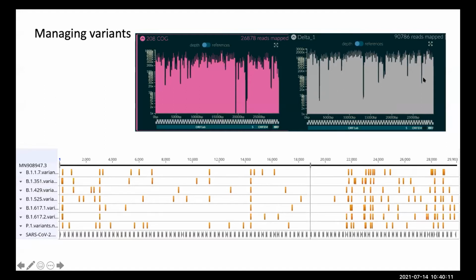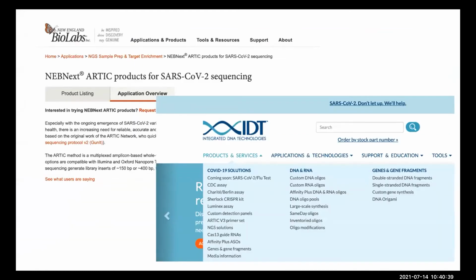We've actually fixed these lower regions now as well, which were caused by interactions where there were mismatches, which meant they weren't being detected. That's what some people call primer erosion, but it's basically where your primers become inefficient or non-functional due to mutations or deletions in the binding sites. So that's something that we have to keep on top of by changing them periodically.